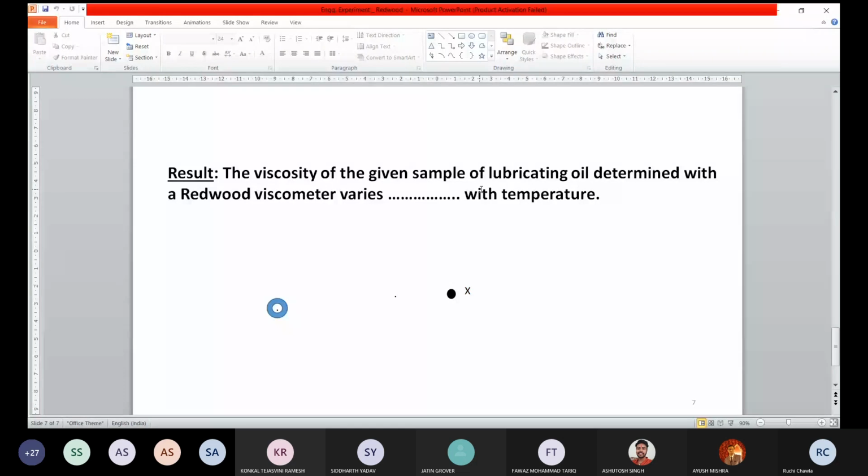This is going to be the correct procedure. Simply circling it, not a dark circle. Again, a circle drawn with a very light hand. Is it clear? How will you locate the points on the graph? Yes, ma'am. Those are the instructions I have given. How you will locate the point on the graph: that should not be a very dark circle. A point made with a sharp pencil with a very light hand, and then you will be encircling it.